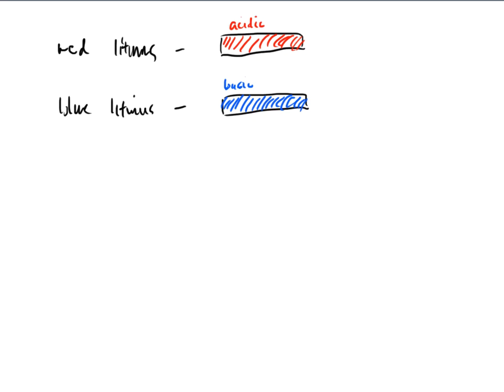So what that means is that if we want something to go to basic, that means we want it to be basic. I can't use basic paper. Basic paper is already a base. If I go to basic and I'm using paper that's already basic, how are you going to do that? You can't.